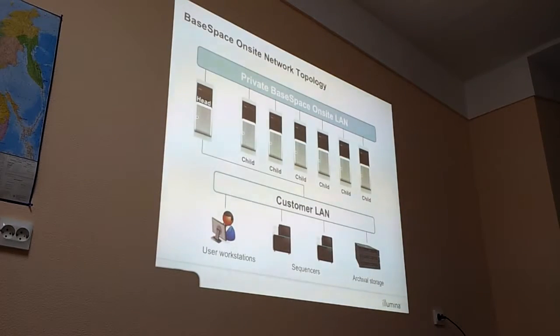And it's this parent-child configuration. So inside this network, you can combine several servers and also combine it with some storage. So you should actually do this, yeah.